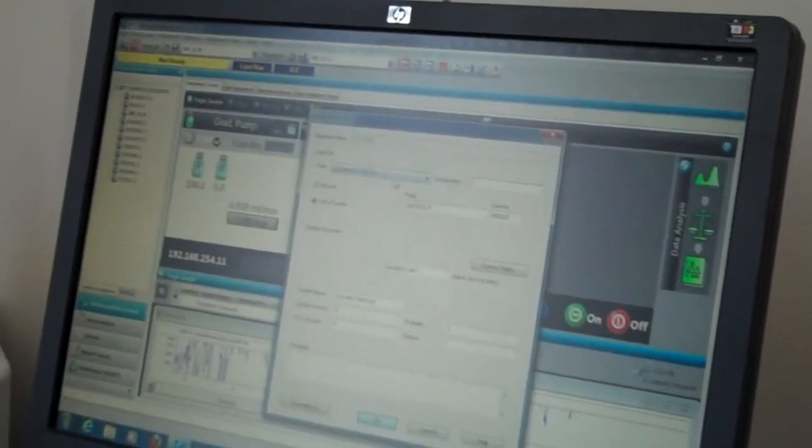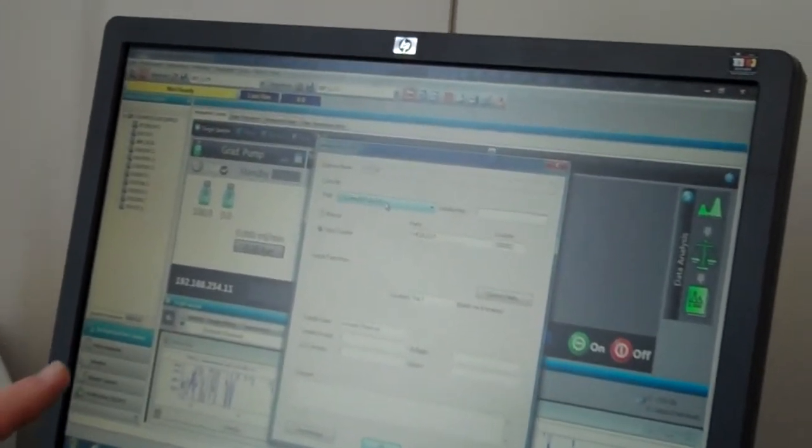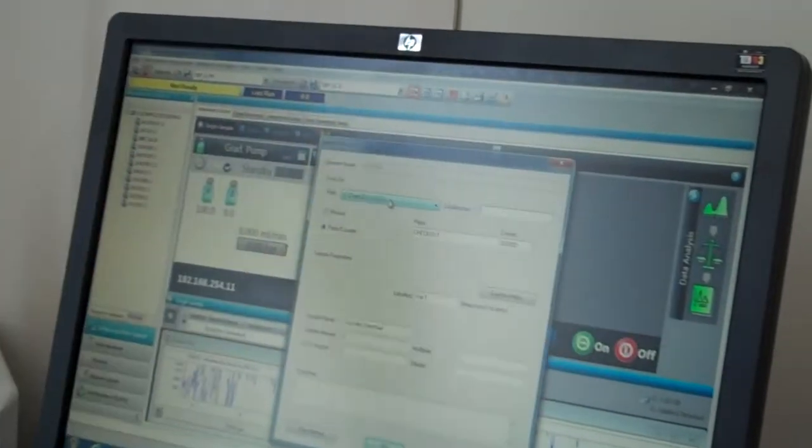If you create a subdirectory in data, it'll create a subdirectory and store your data from this run and other runs that are set this way in there. So each lab group could have their own subdirectory. And that would be a good way of organizing.